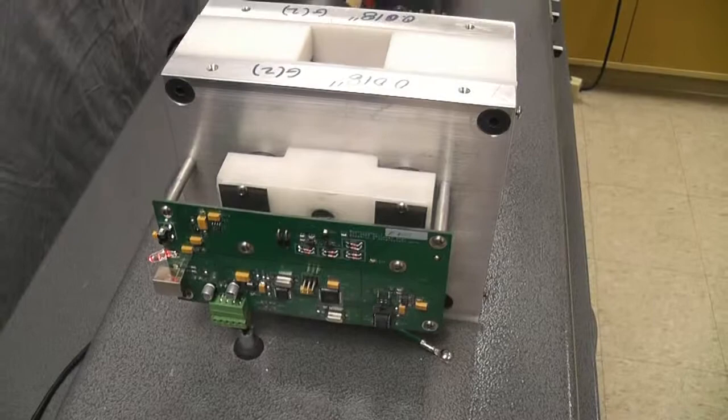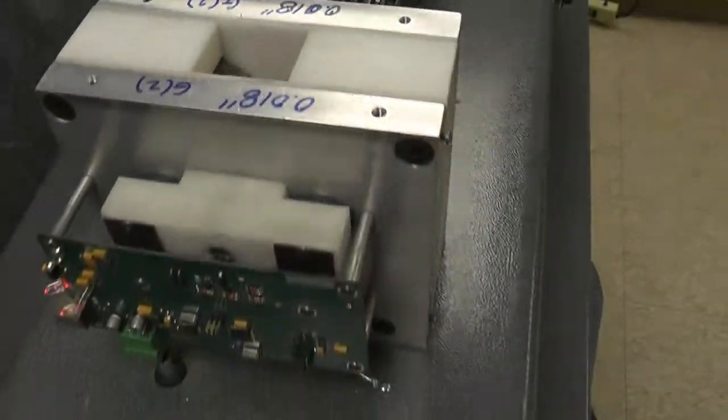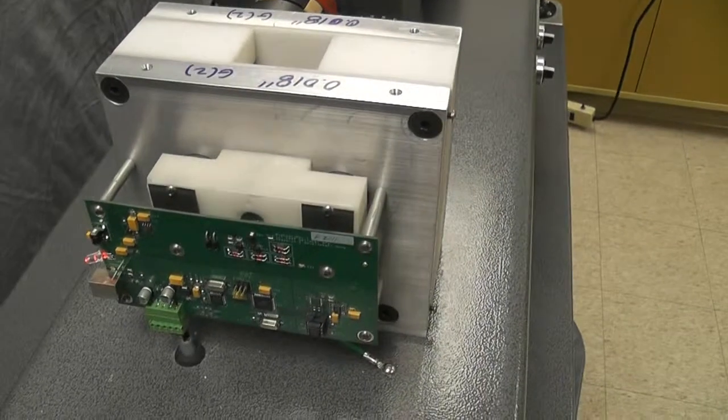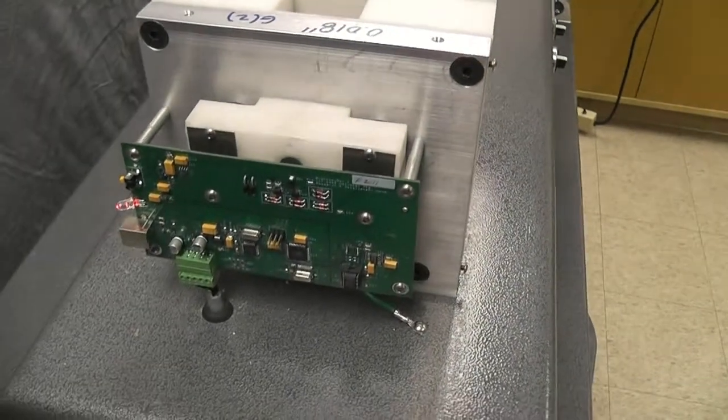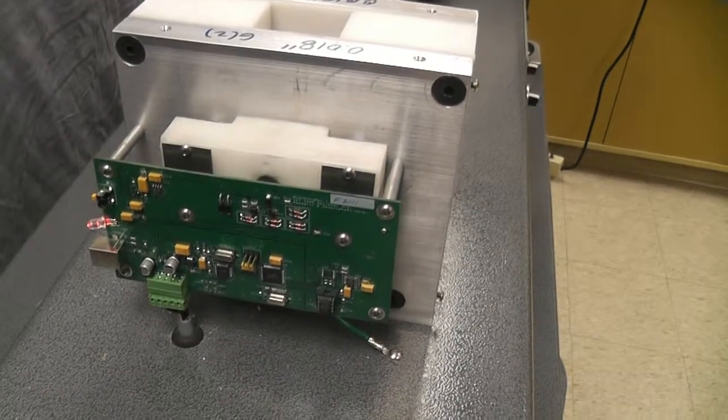And if there's an insect inside as it's being crushed between those two rollers, there will be a spike in the conductance. This circuit board digitizes that signal and sends it over to the computer.